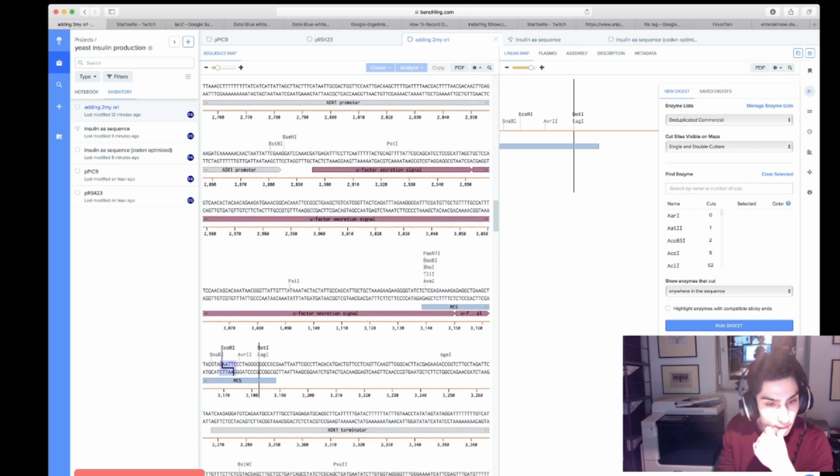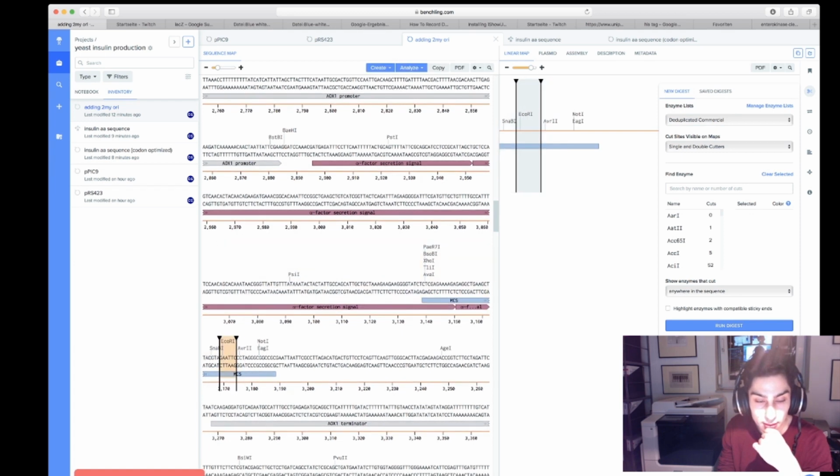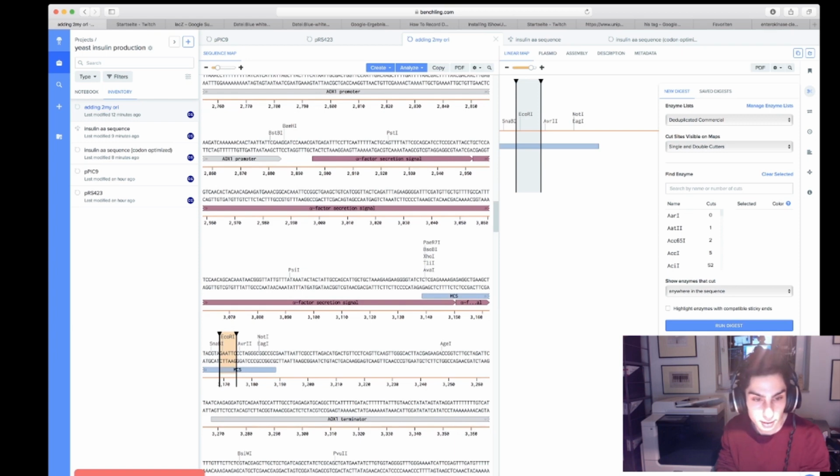Yeah, true. I just wanted to look whether with the cut site there would be the possibility of a frame shift occurring, but no, that's not a problem, I think. Right. It seems to be multiples of 3, so we're good. Otherwise, you should be warned by Benchling in the cloning process also. Yeah. Okay.